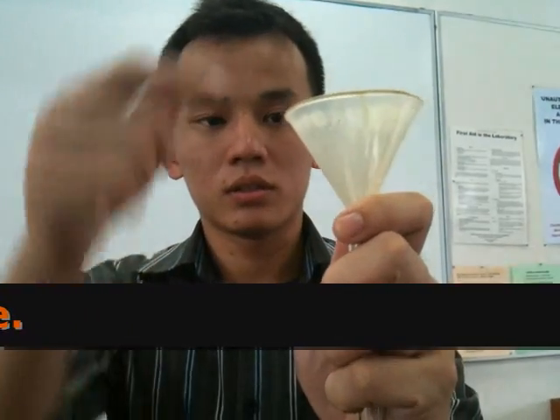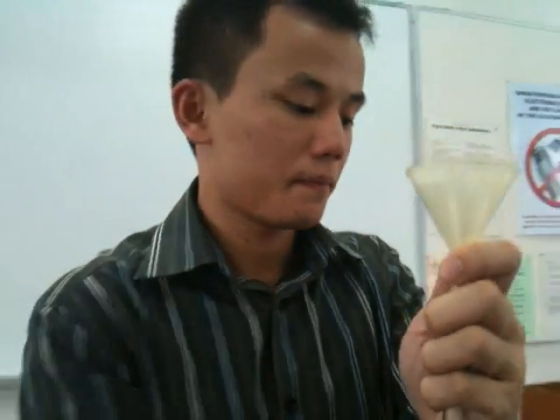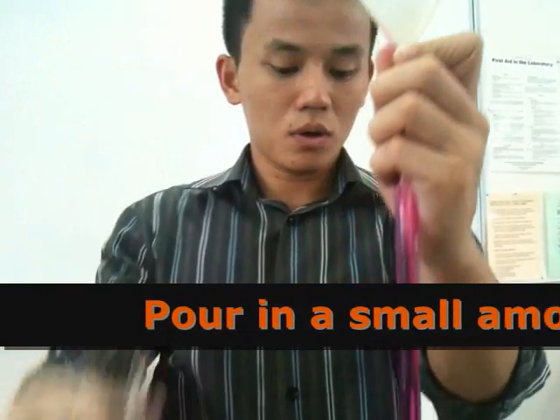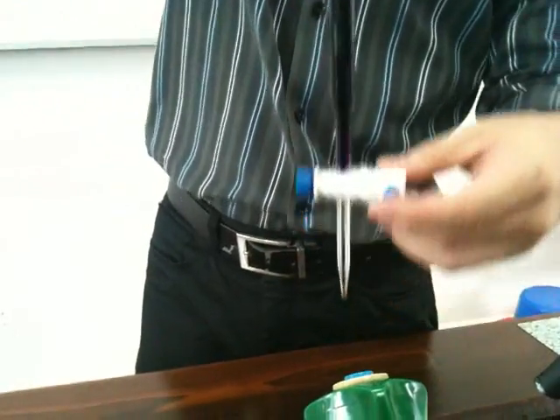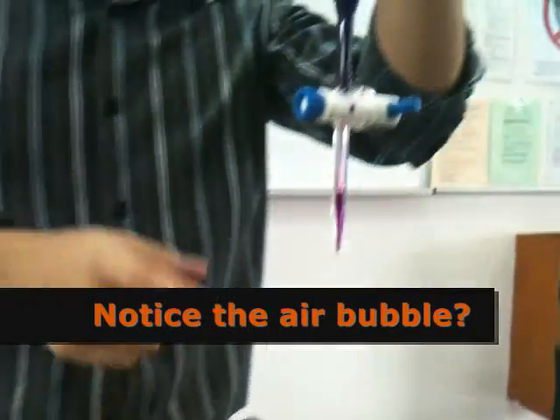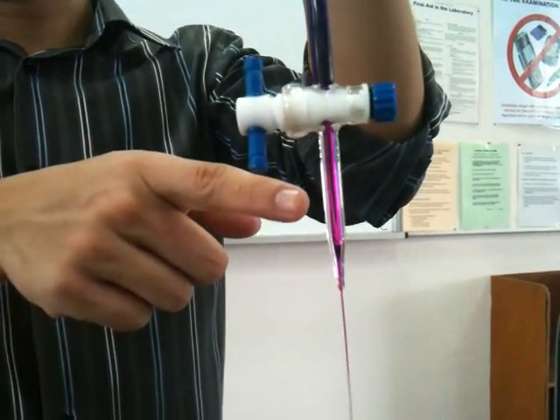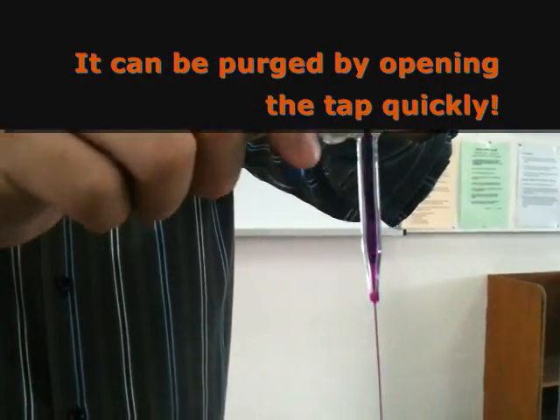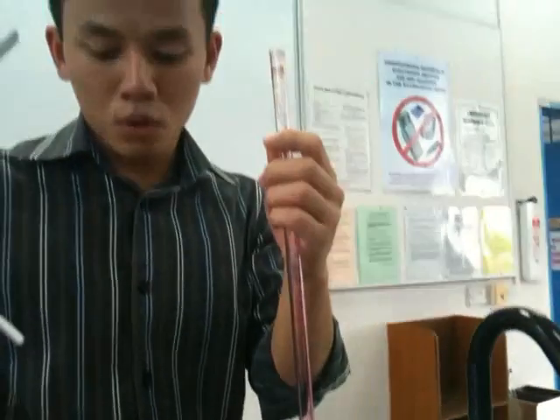When you pour, air has to come out. When you pour your KMnO₄ in here, air has to come out. Pour a small amount in and let it out. For some of you, you might find a bubble at this stage. If you open the tap very slowly, the bubble will be maintained. In order to purge the bubble out, simply open the tap very quickly and you'll find the bubble is gone.